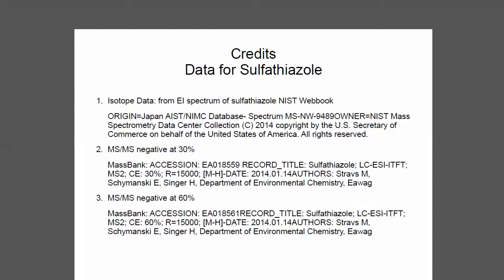The data was obtained from two different sources. For the isotope data, I took the molecular ion and the associated isotope peaks from the NIST webbook spectrum of sulfathiazole. For the fragmentation data, I used two different negative ion fragmentation spectra from MassBank.